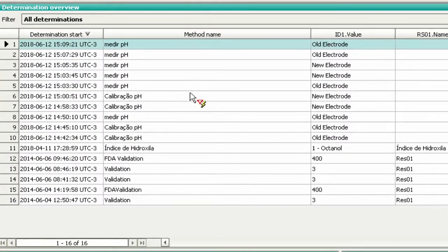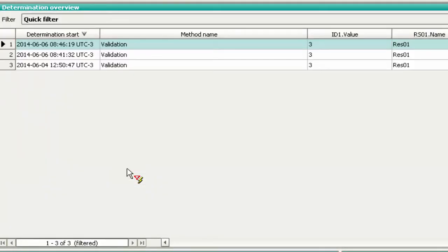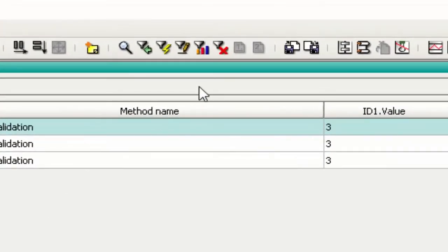For example, see all the determinations made in the method validation. To undo the filter, just click the 'Remove Applied Filter' button.